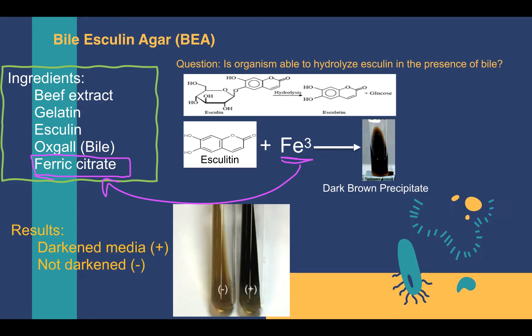Let's look at the results you may receive from this test. In the lab, when reading these results, it is helpful to hold the tube up against an uninoculated tube so that color changes can be perceived more readily. The first tube here is not darkened, so this would be negative. The darkened tube indicates a positive result. If there is no blackening, we consider it a negative result.